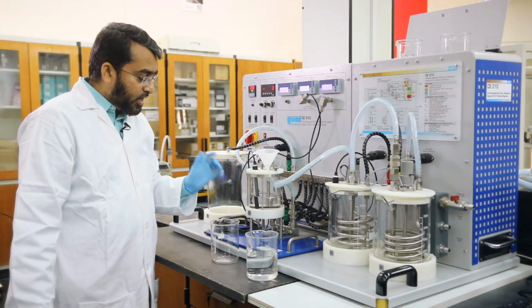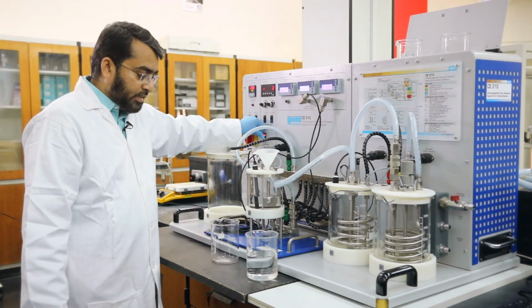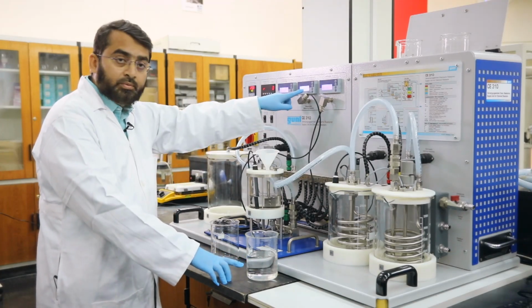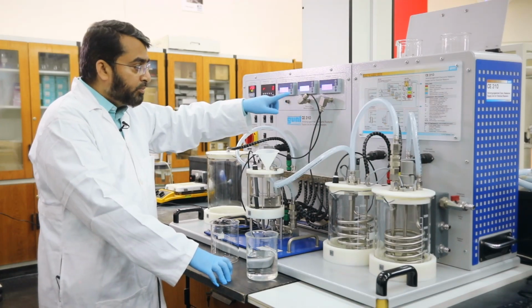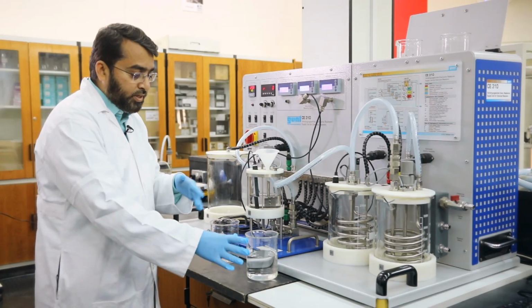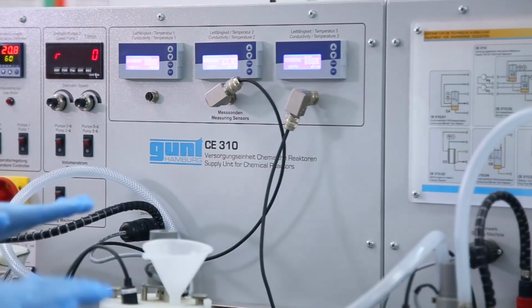Now, once we add ethyl acetate, the volume will be doubled, and the conductivity will be half, because ethyl acetate doesn't have conductivity. So when we mix it, conductivity becomes half. It means mixing is complete.